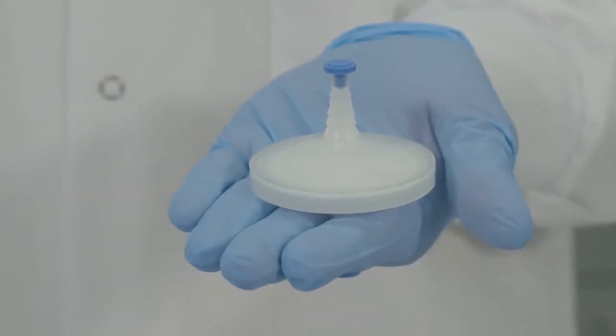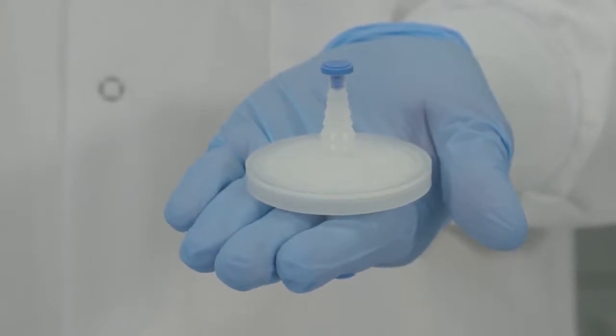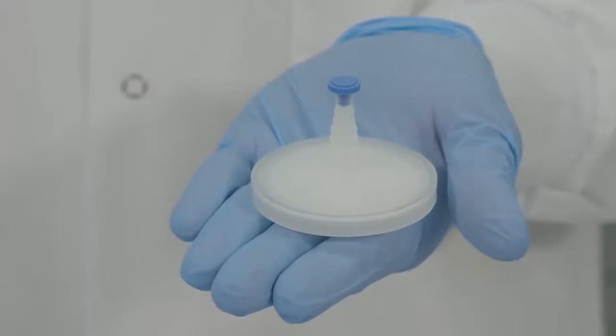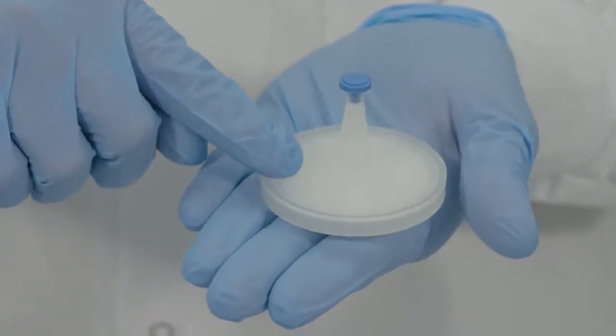For a 50mm syringe filter, the liquid needs to go from the side that is marked as inlet to the side that is marked as outlet.